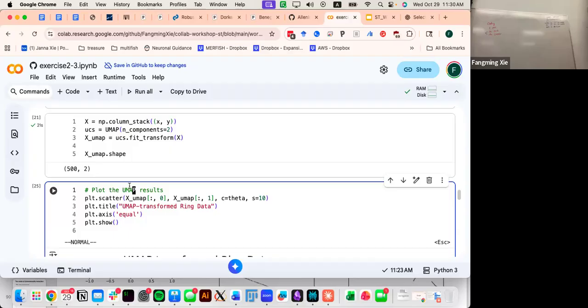So this is just the function. Oh, okay, so the PCS function had data. Yes, exactly. Because PCS actually still has the data. Yeah, you could check, but it's also a great reminder.